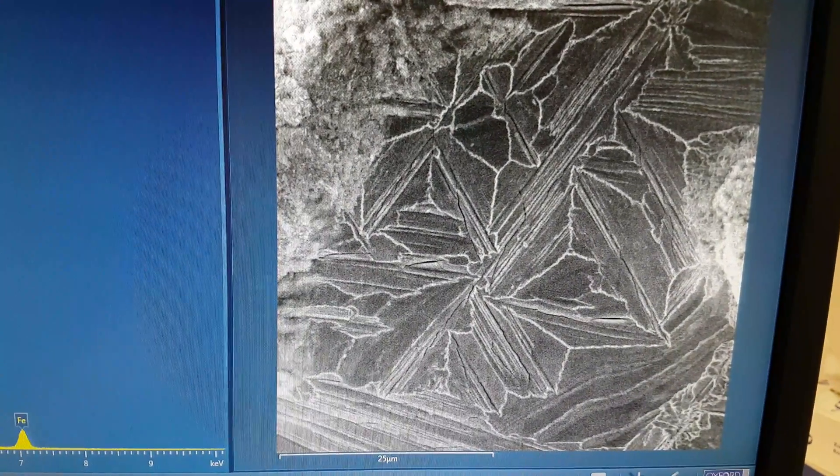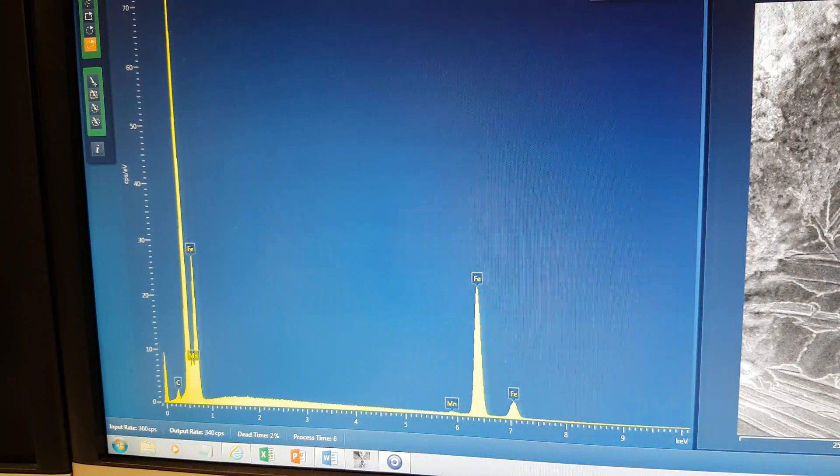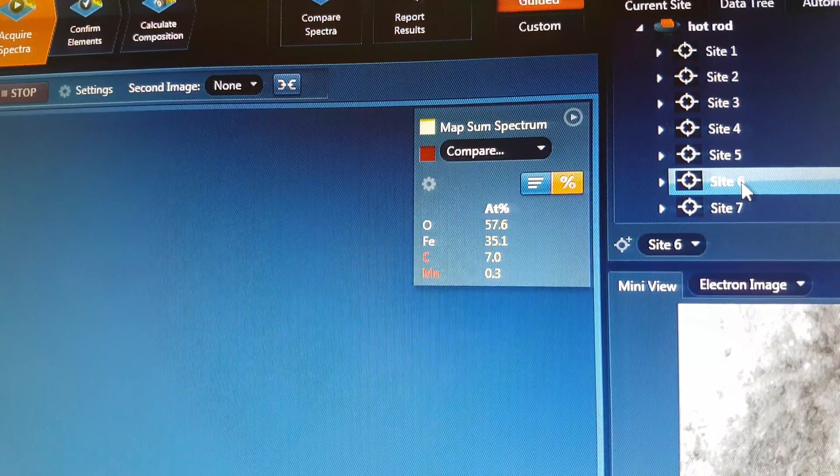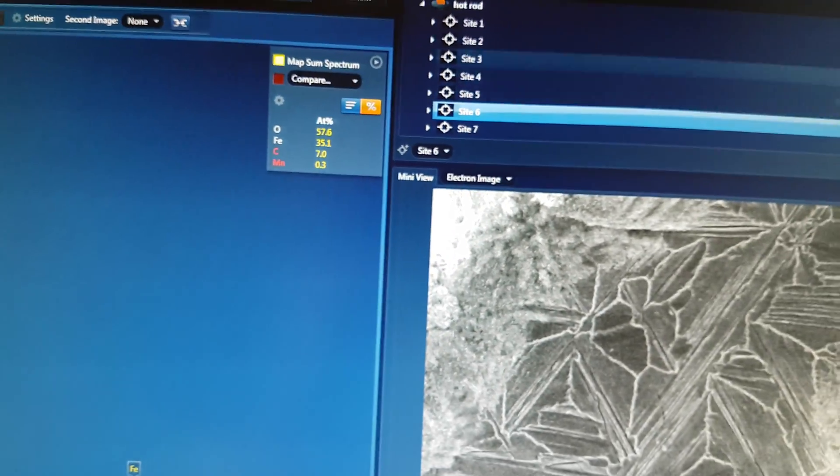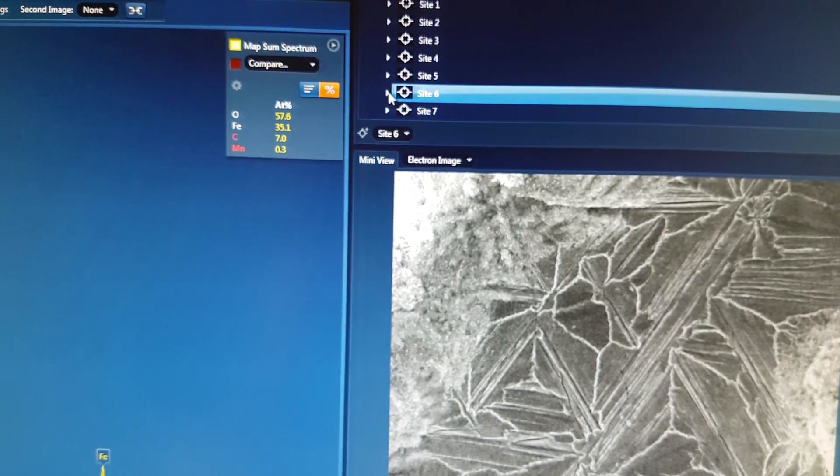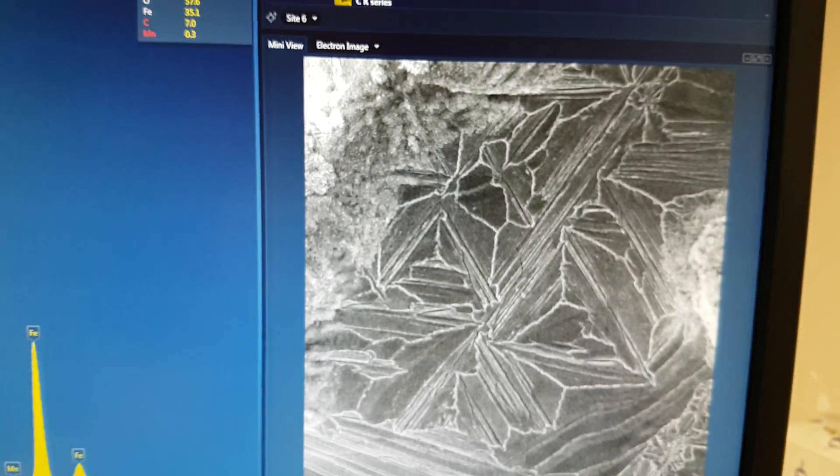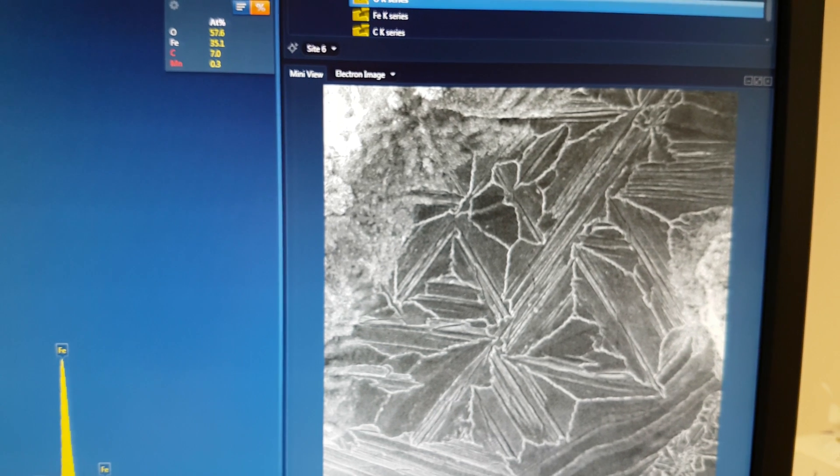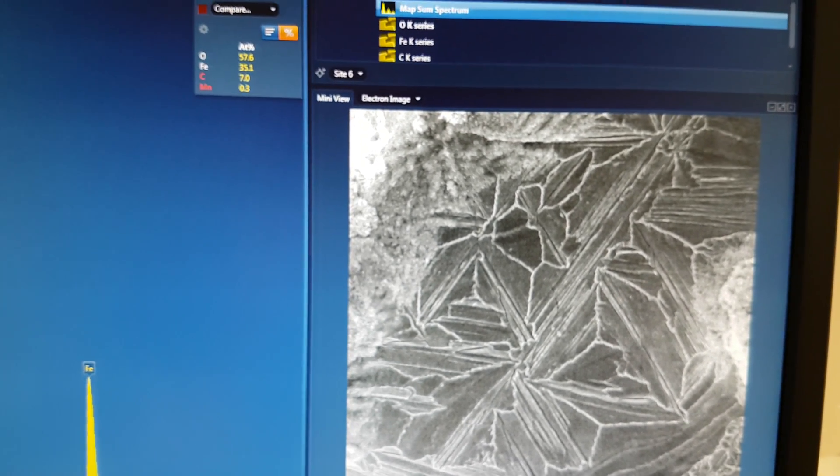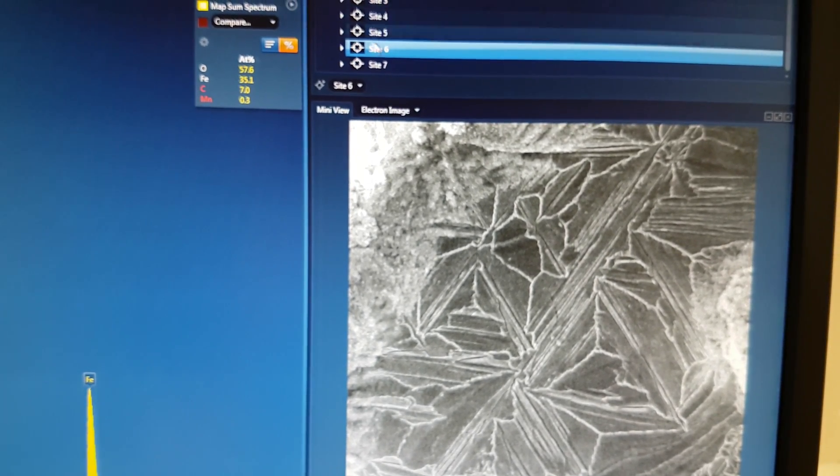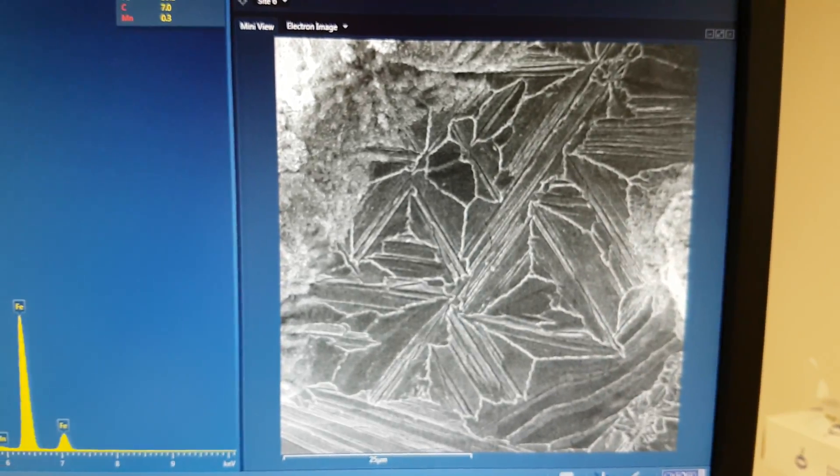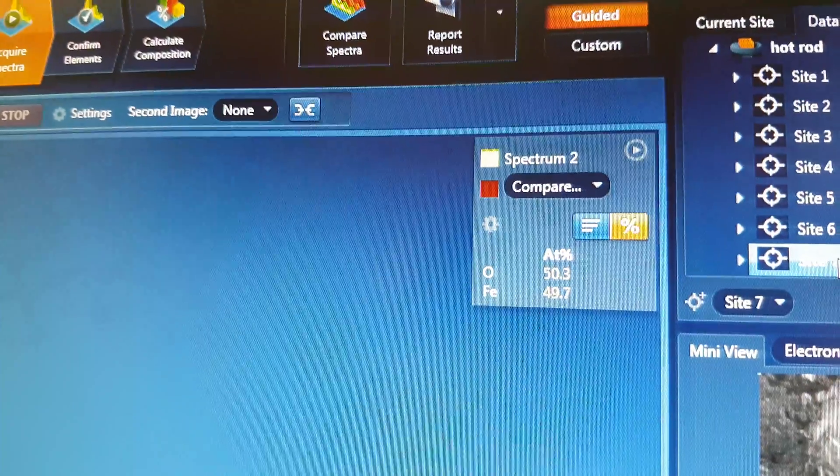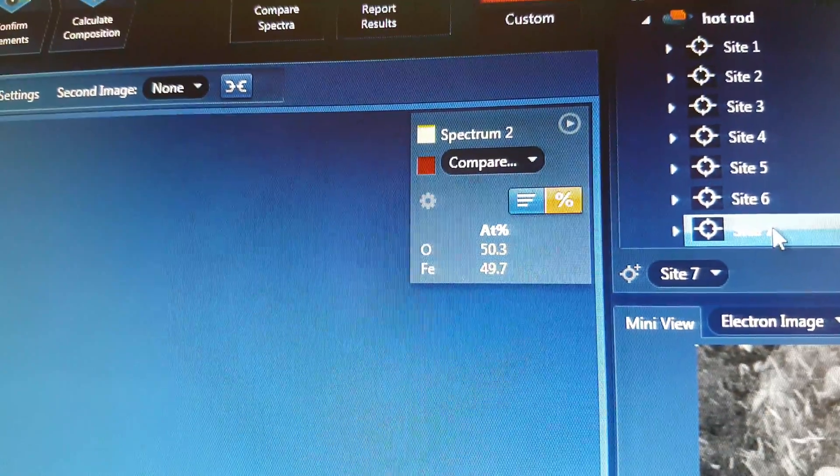So that's quite striking. And it's almost like a completely homogeneous mixture. I think actually we can go in and you can see a bit more detail. We'll follow up that in a minute. The other type of structure is this one which again is FEO.